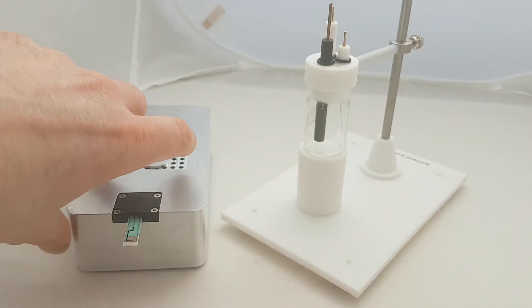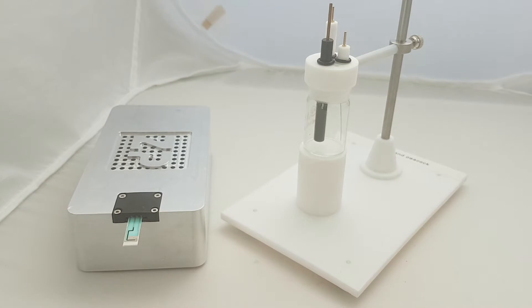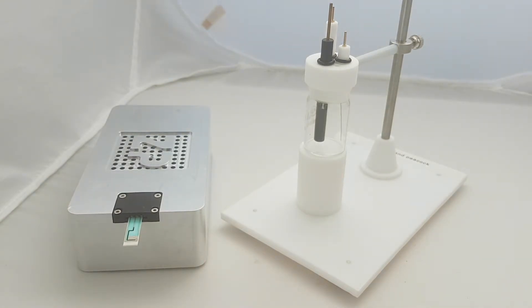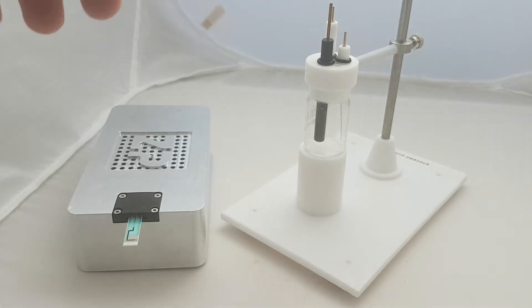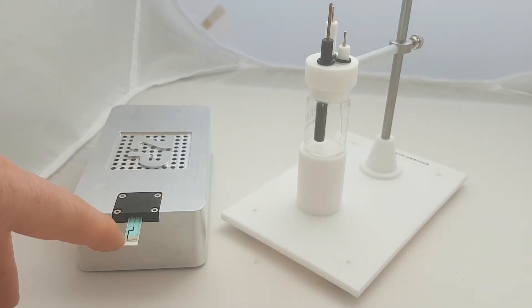In summary, Zimmer and Peacock provides tools for getting our clients and customers to market, specifically in sensors and biosensors. We often do it with these disposable sensor configurations.